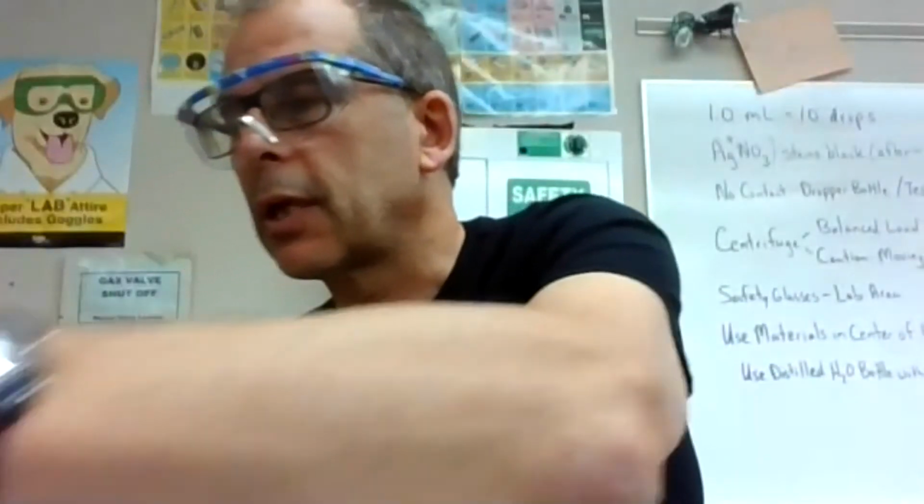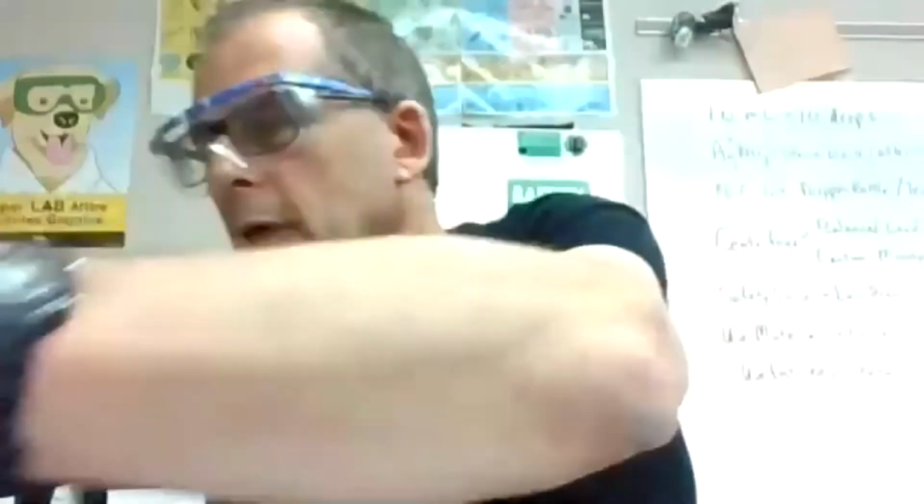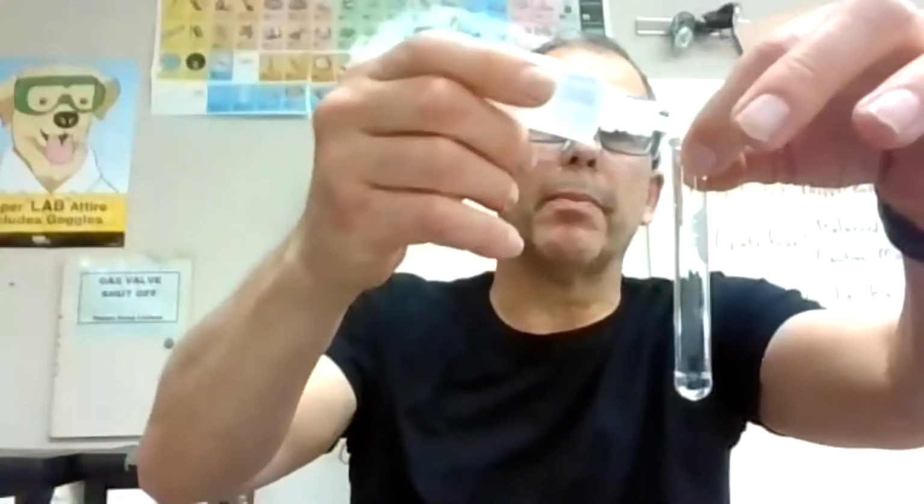Okay, that looks pretty clear with the magnesium. Let's go to the calcium. Looks pretty clear. Let's go to the strontium. Okay, definitely cloudy right there. And let's go to the barium. Even more cloudy with the barium.